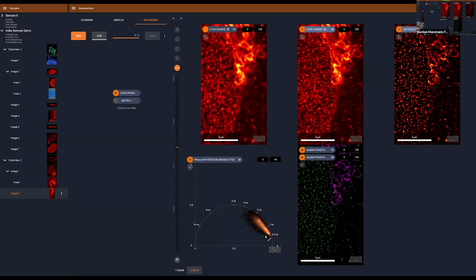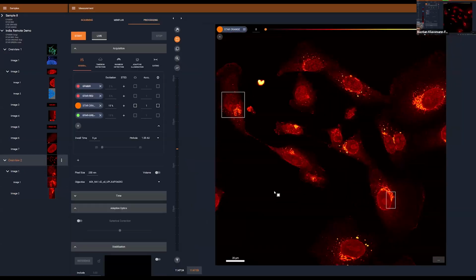So you can only work with very, very low STED power. But because the STED laser is interfering with the lifetime of the fluorophores, you can use the lifetime information to increase your resolution quite a bit. So I could also go here. Again, find a new ROI. Now I'm only looking at the nuclear pores here. I can do this.